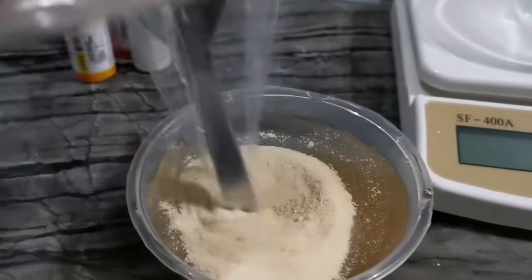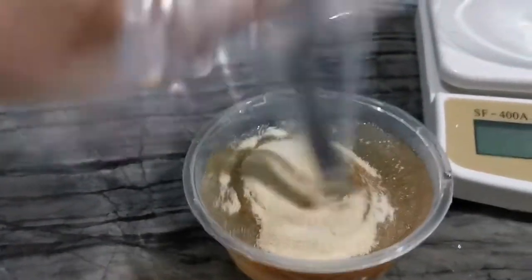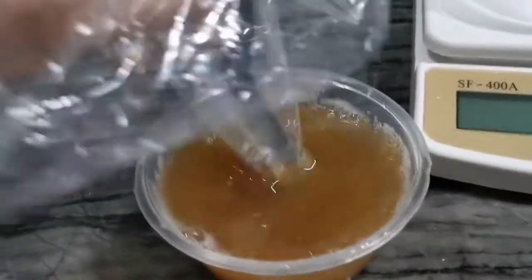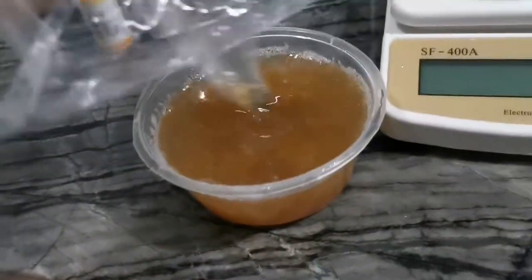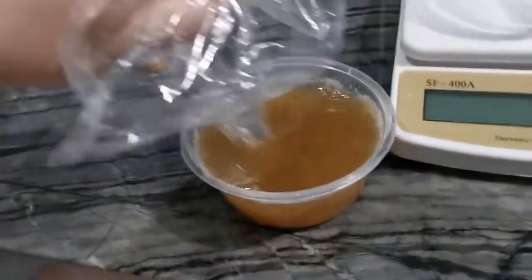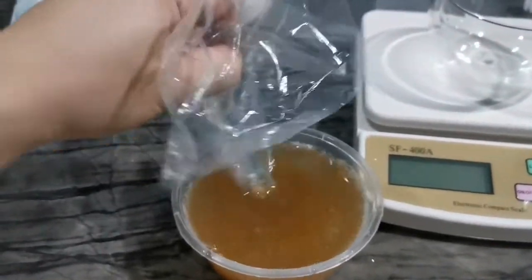We have to really stir it vigorously into the solution to make sure all the gelatin gets dissolved and it's not lumpy — get it all homogenous. If it's not dissolving properly you can put it back into the microwave and heat it up a little bit, but not until it's boiling.